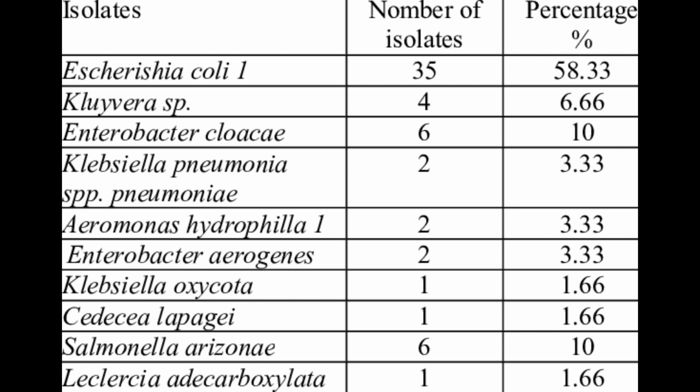If positive, then the purple butt, putrescine. Those which have the ornithine decarboxylase will act on ornithine and produce putrescine, which is an alkaline product, reverting the butt into a purple color. There is a slight yellow tinge because of the acid from glucose. And their negative is bright yellow butt with a thin, narrow purple rim at the top of the medium. They are motile if the medium is hazy, and non-motile if growth is confined only to the line of stab and the top of the medium while the surrounding is clear.